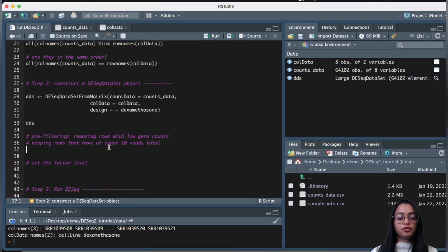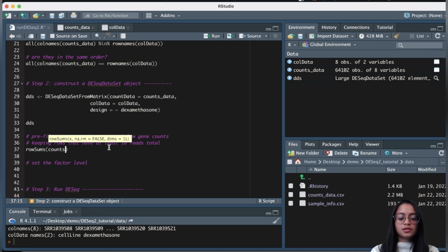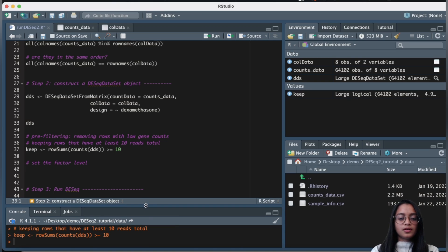There are a couple of things we can do before running differential expression analysis. We can perform some pre-filtering on our DESeq dataset object to remove rows that have low gene counts across all samples. This is a recommended step, not required, but it helps reduce the size of the DESeq dataset object and increase the speed of computation. I'm going to remove all rows that have less than 10 reads across all samples. Let's start by calculating row sums for the DESeq dataset object.